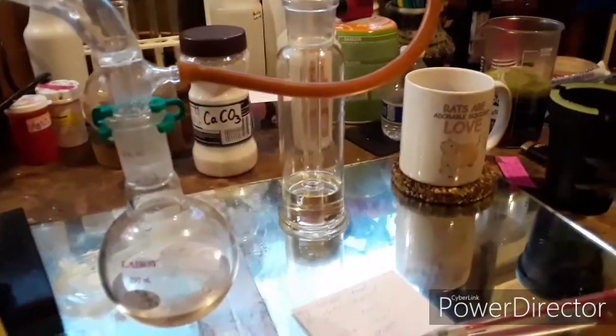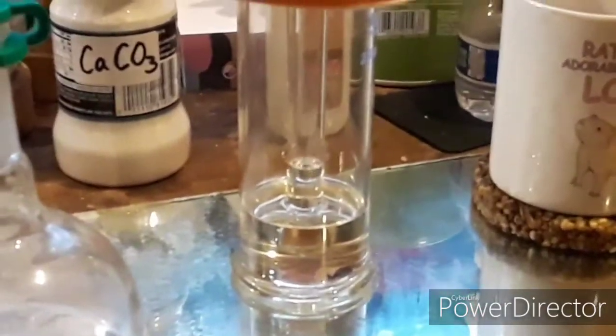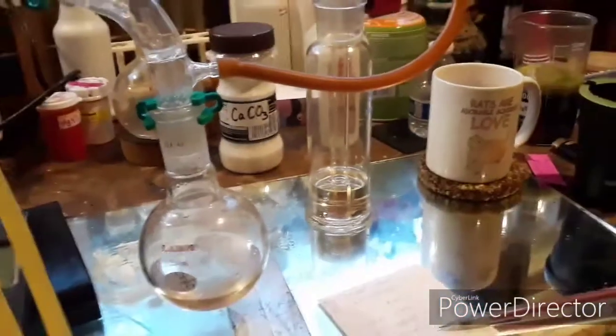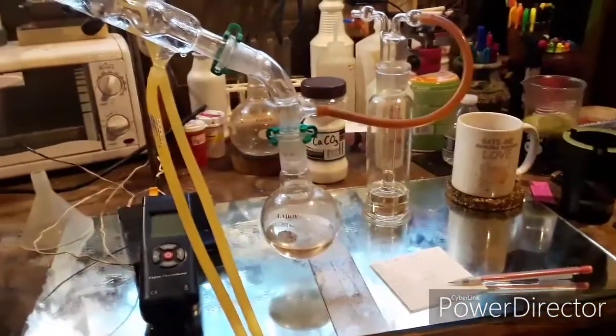Another thing of note: I've got a little wash bottle set up there with a pretty generous amount of 90% sulfuric acid in it. That's to trap any sulfur dioxide that makes it past the condenser — it's bad for the environment and not great for the metal objects in here either.